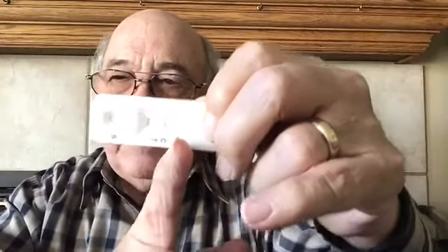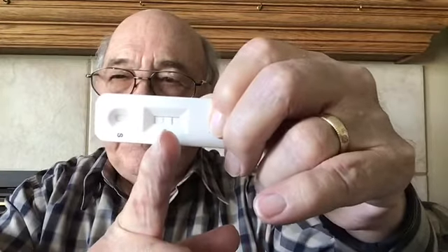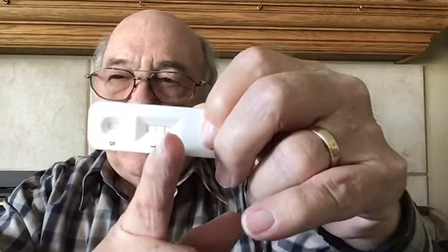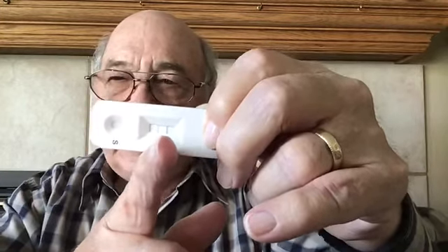And if the test is working, the C line will show up. If it's a positive test, the T line will also show up. So you can see that that's a positive test. The test is working, and it is testing positive for human blood.